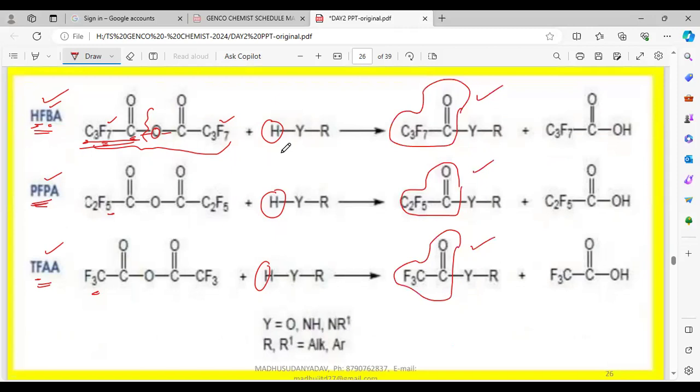Okay, the initial compounds are not detected. These are not detected. This can be detected. So we convert the sample so that it becomes detectable.